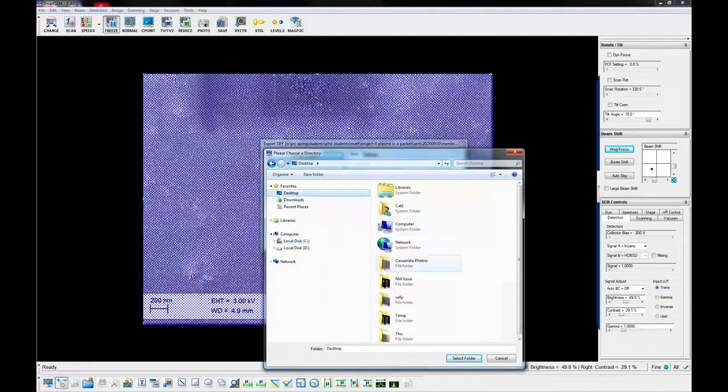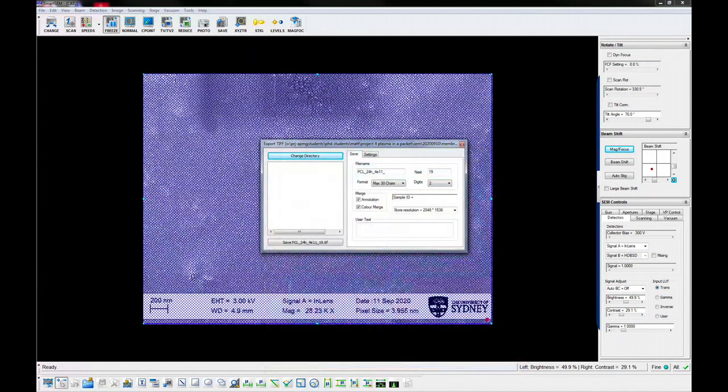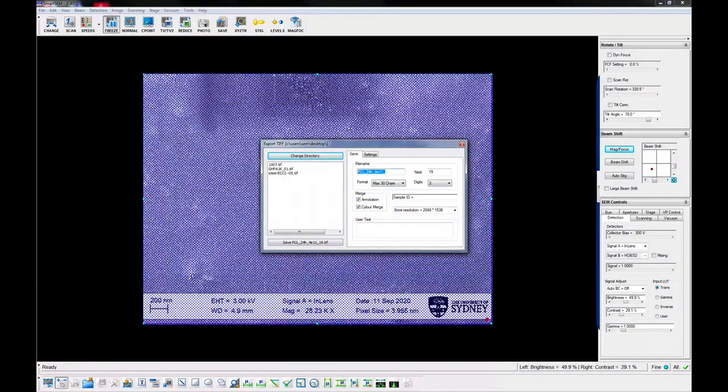Use the file save dialog to save the image to RDS folder. Set the appropriate path and file name and reset the increment counter. Press the freeze button again to resume scanning.